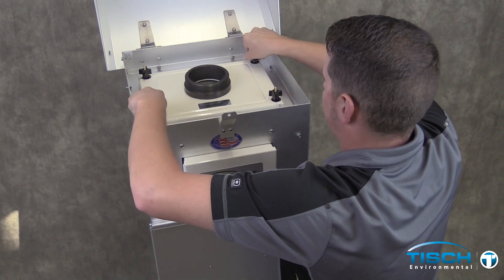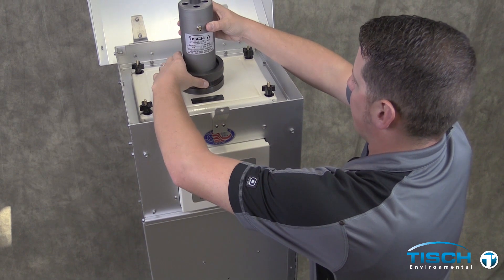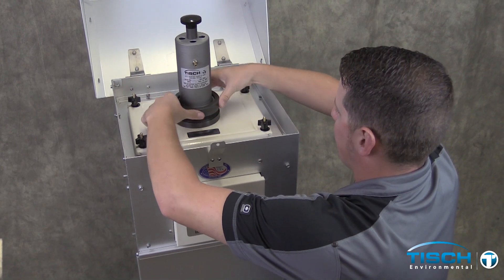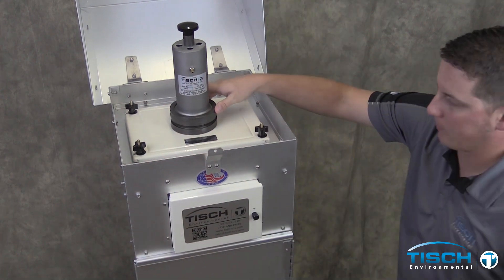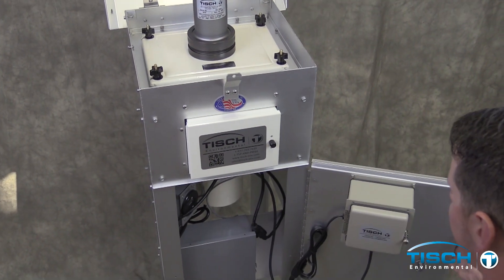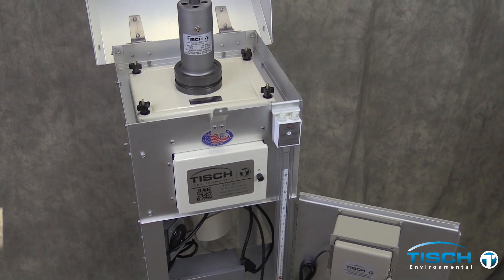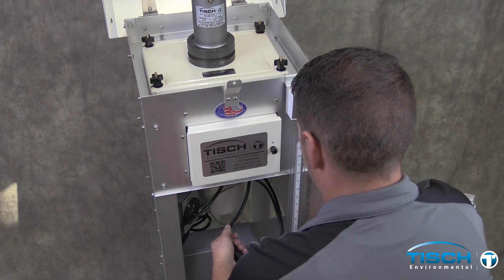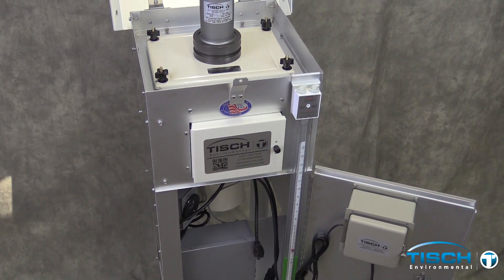Tighten all four nuts up so they're snug. Install the TE-5028 calibrator. Open the door up and install the TE-5030 30-inch water manometer.